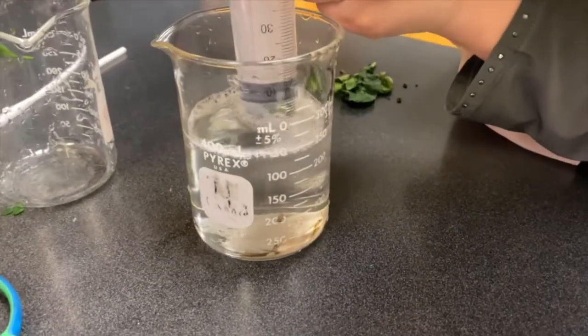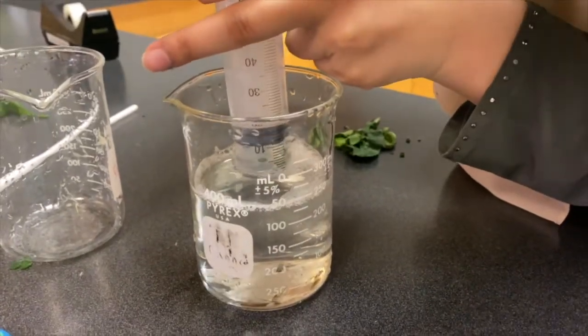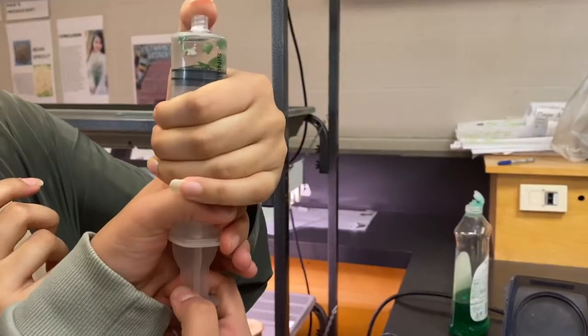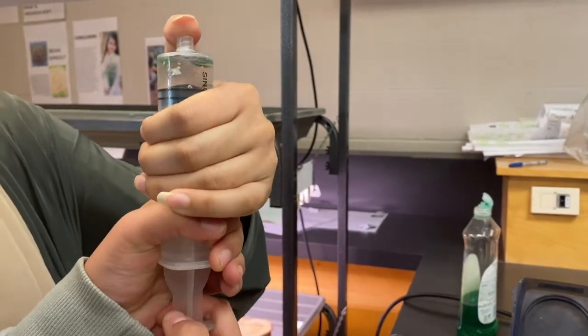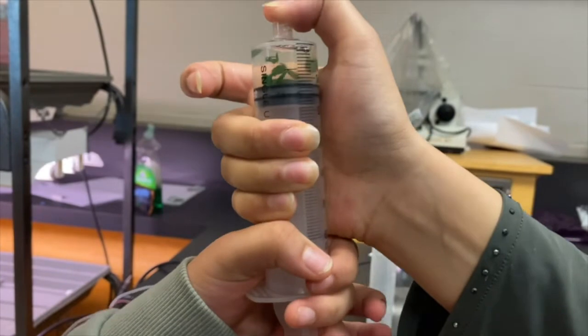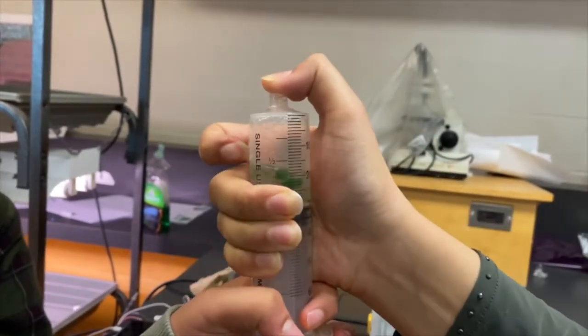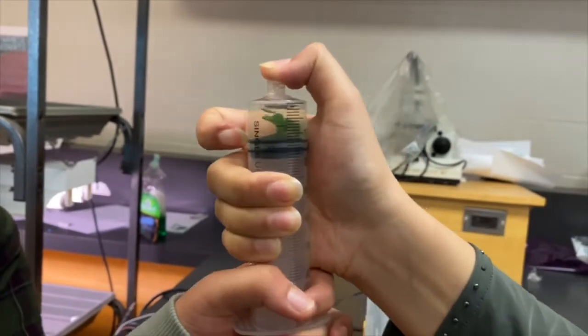Draw approximately 6 to 8 milliliters of the bicarbonate solution into the syringe. The leaves should float in the solution. Hold the syringe with the tip upwards and remove the air by gently pushing on the plunger. Plug the tip of the syringe tightly with your finger and gently pull the plunger backwards to create a vacuum. There should be tiny bubbles coming from the disc.